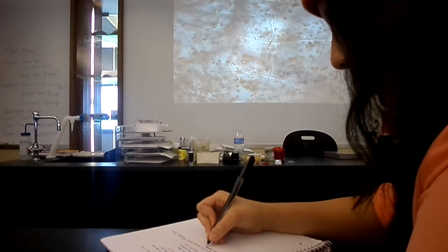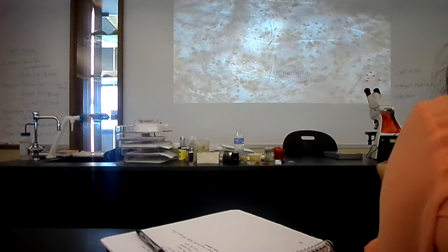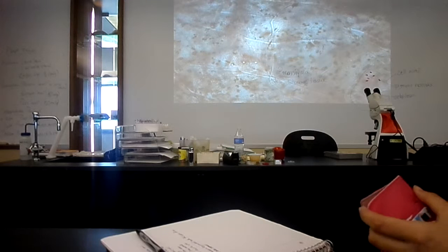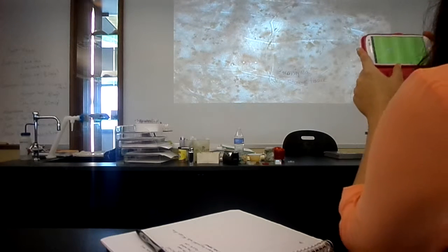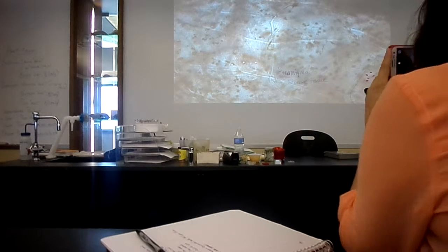Yes. For the test, do we need to know it as parenchyma? You need to know that if I put this slide up on the test and ask you what kind of tissue it is, you should be able to identify it as parenchyma tissue and tell me that it is a storage tissue. And be able to label these three things.